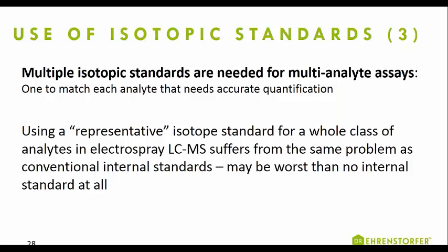For a multi-residue method, it's impractical to have an entire matching set of internal standards, so all laboratories will break the analytes down into groups and choose one member from each group for an isotopic internal standard. But if you have any analytes within the multi-residue suite where accurate quantification is absolutely critical, then as a minimum each of these should have its own matching internal standard.